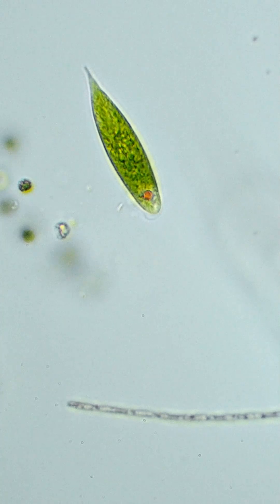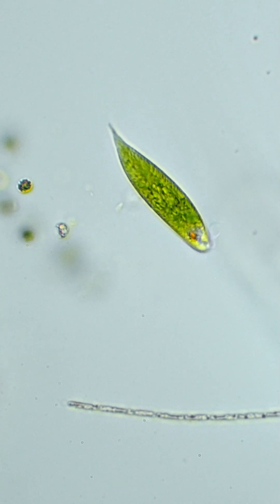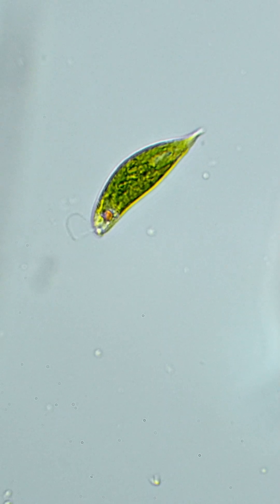Inside its body, there's a tiny red spot, an eye spot that senses the direction of light, helping it move toward brightness.